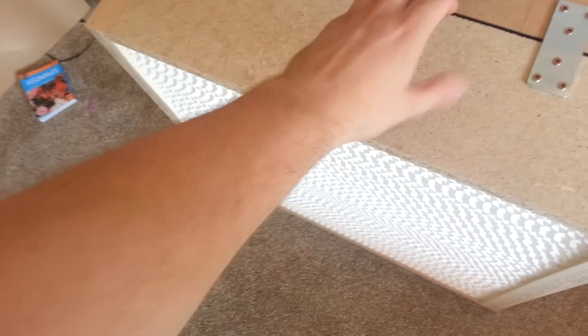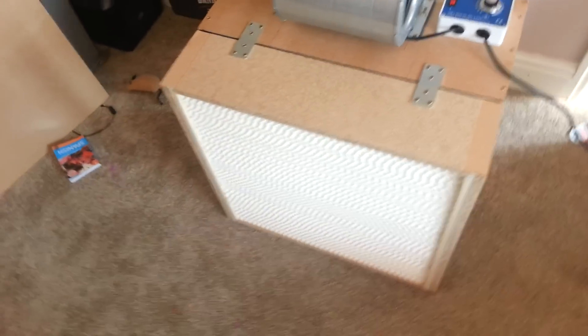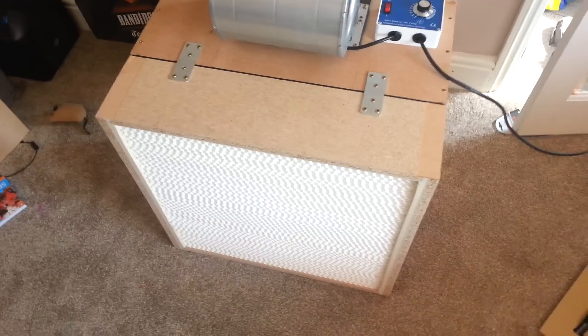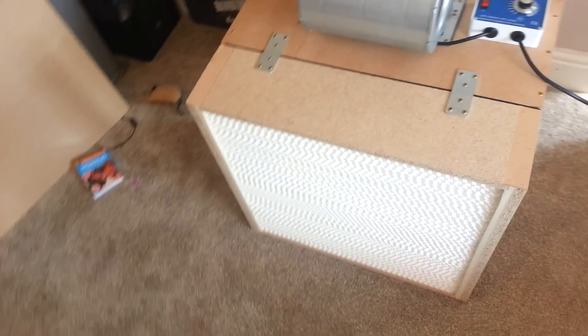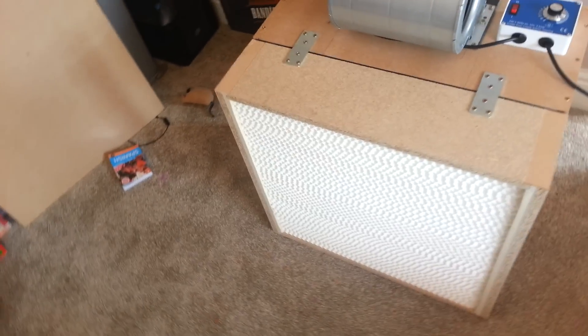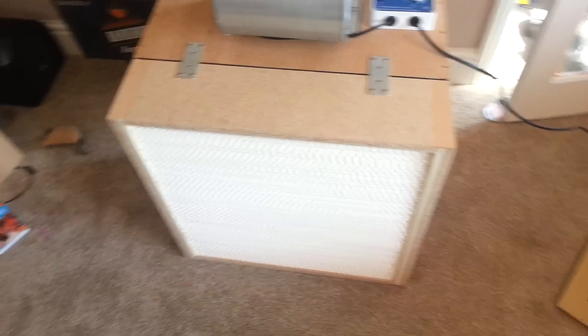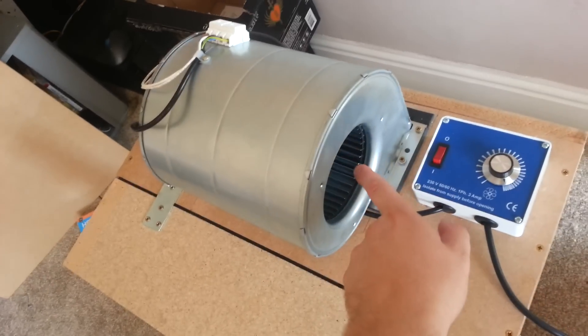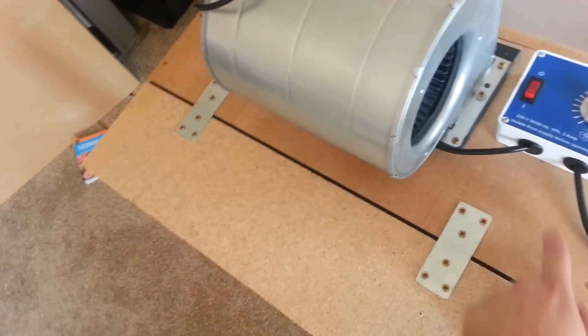This block here is a 5.5 inch HEPA filter. It filters out particles down to 0.3 microns to 99.99% — that means things like mould spores, bacteria, and even some viruses won't get through. It draws air in through here, then pushes it into this back box and then through the HEPA filter.